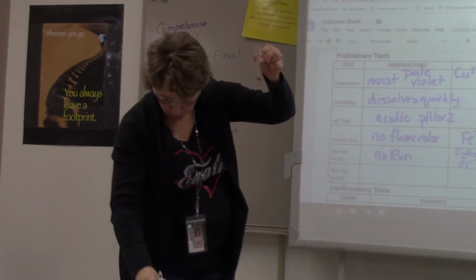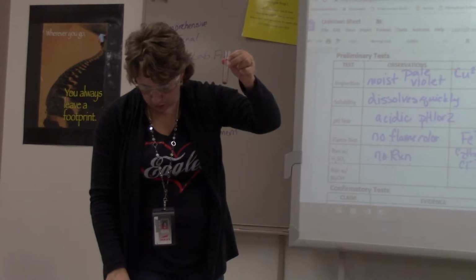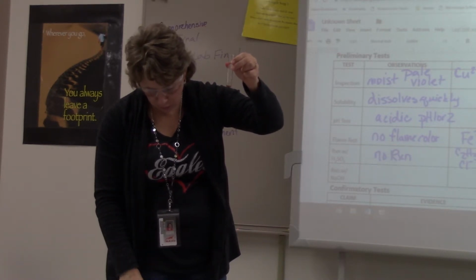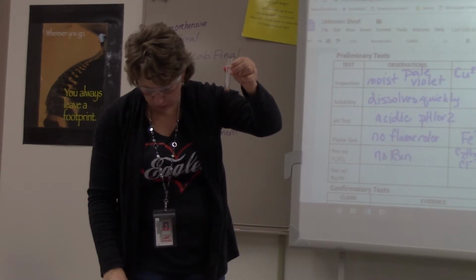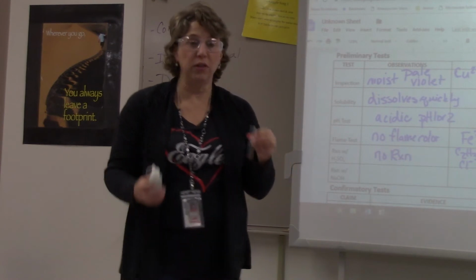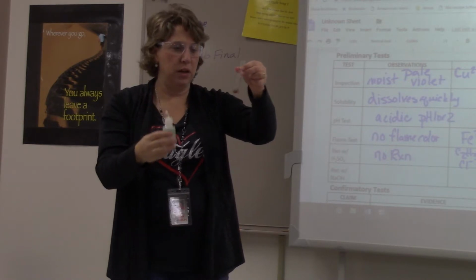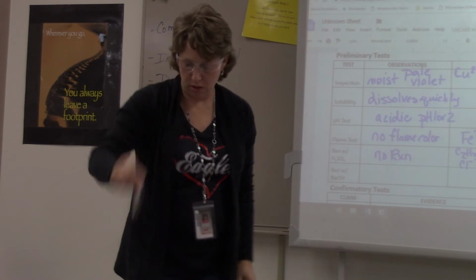Okay, now notice it says, if no precipitate forms with an addition of 1 drop, do not add more. But if a precipitate does form, you may have to add many more drops of sodium hydroxide. Shake gently after each additional drop. So there are some different tests that are going to say that they react a certain way. We can put in a couple of drops here. Nothing really happens. It's just a red gelatinous PPT.